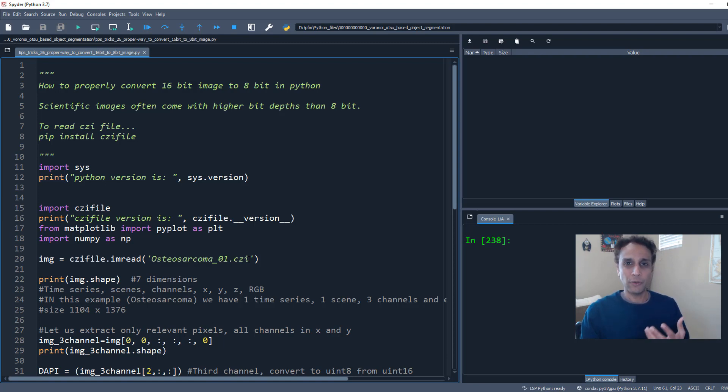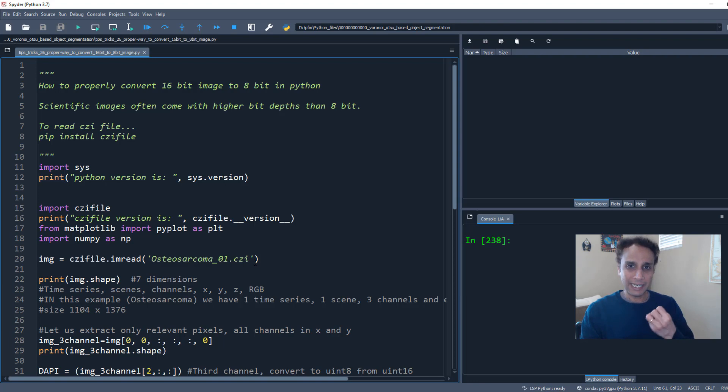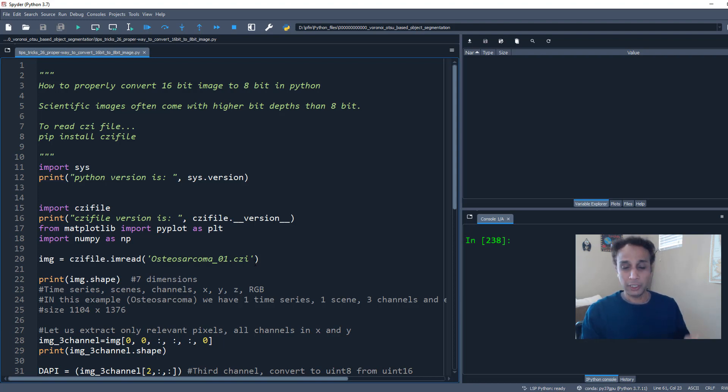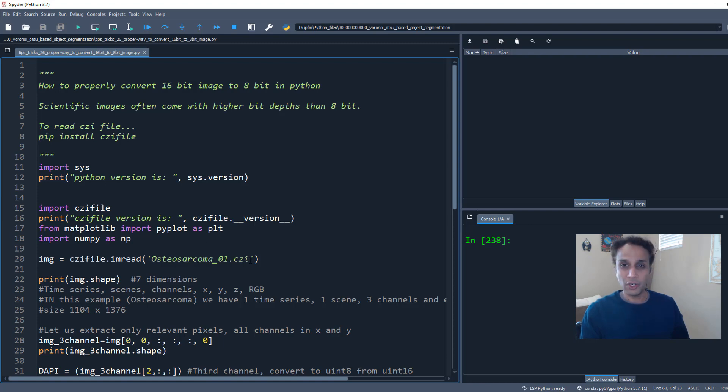So whatever format you're working with, whether it is a DICOM or satellite images, go ahead and use the appropriate library to read that image and convert that image into a NumPy array in Python. So the way I'm going to do that is using CZI file library. And I already installed pip install CZI file. And this is my file name right there, osteosarcoma_01.czi. So let's get started.